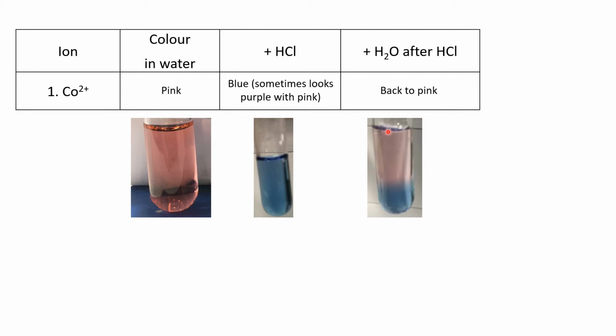Then I took that solution and I added more water to it, and what happened was that it started turning back to pink. Again, I've caught this as I've added enough water to turn the top half pink. We haven't quite got yet to the bottom half.